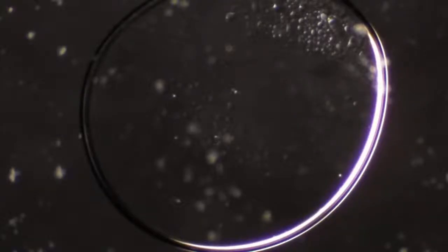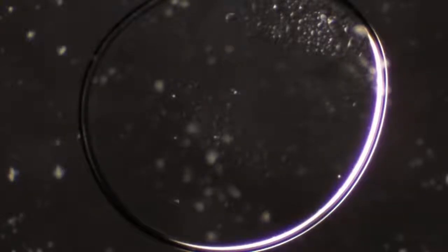That's odd. Looks like it blew it up a little more than I wanted it to. Opposite effect. Let's do transform, reset transform. Actually, I did want to flip the vertical because that's confusing. And let's do transform, fit to screen. There we go. That's as good as it's gonna get. It's not the whole image, but it's better than it was.